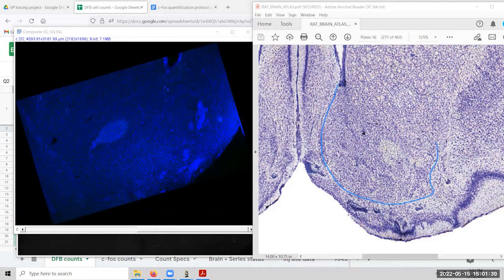The accumbens core wraps within that, but its backbone is going to be around here through there. This is not the cleanest separation. This will do generally, especially since I'm not too concerned with getting the exact lateral dorsal edge of the accumbens core or figuring out again the lateral accumbens shell. And if you could mimic this on this drawing up here, it does help. So we're going to keep that there. We're going to go back to here.